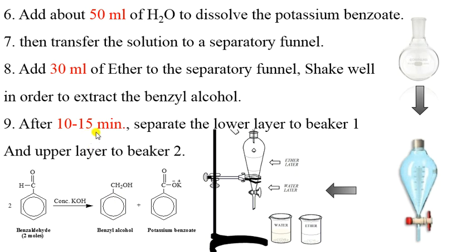After 10 to 15 minutes, separate the lower layer, which contains the aqueous layer. Then add the upper layer, which contains the organic layer, to beaker number 2.